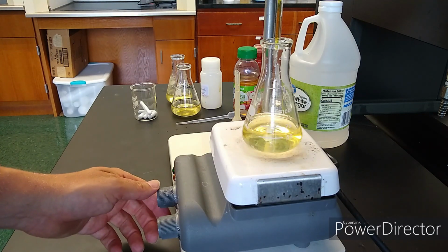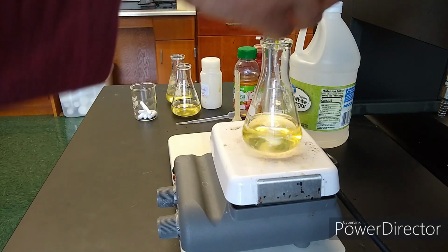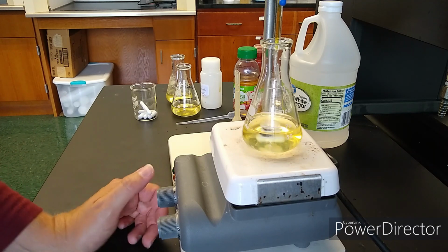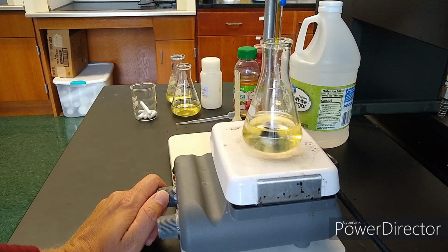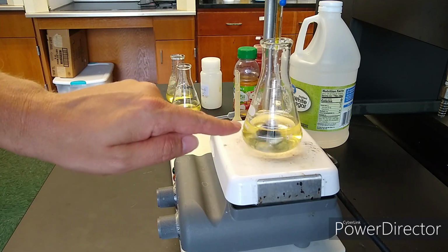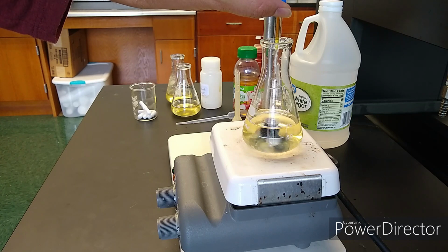Turn on the stirrer. Oh yeah, auto stirring. And commence the titration. I'm going to add the iodine. Now at first I can add it quickly because I know that it's not going to change until somewhere after 20 milliliters of iodine has been added, according to our preliminary trial at the beginning. But you see that purple color is in the middle, right where it's hitting the solution. That's where the iodine first hits the starch before it can escape and react with the ascorbic acid.